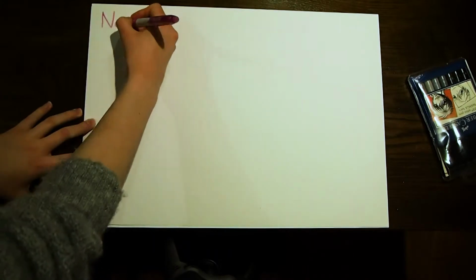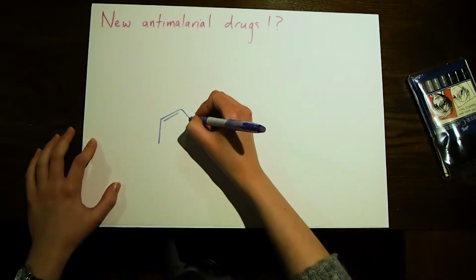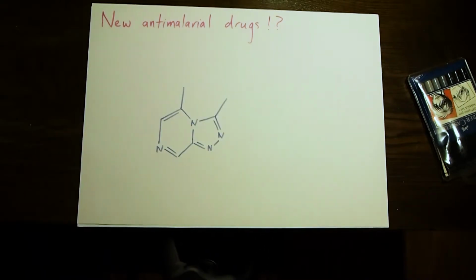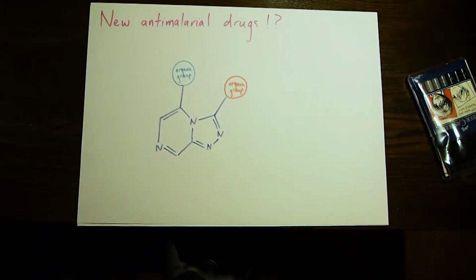Consequently, we need to find new treatments that can be made cheaply, administered orally, and are not toxic. In our labs, as part of an open-source drug research program, we synthesized potential new antimalarials from the triazolopyrazine family, with each lab team attaching 2 different organic groups to the molecule.